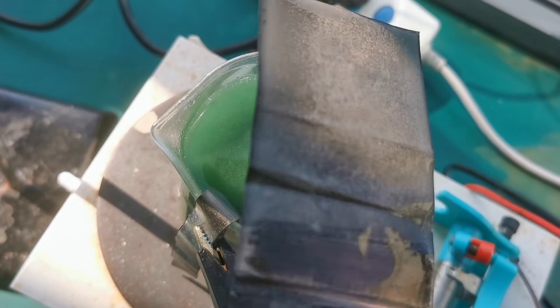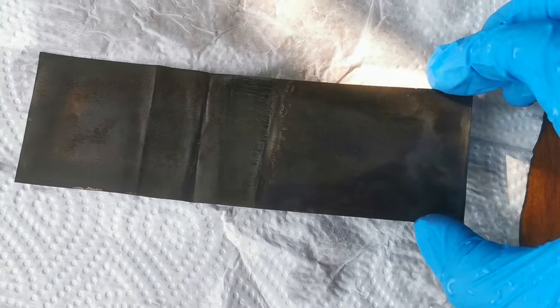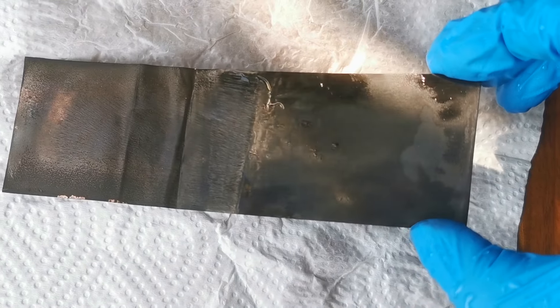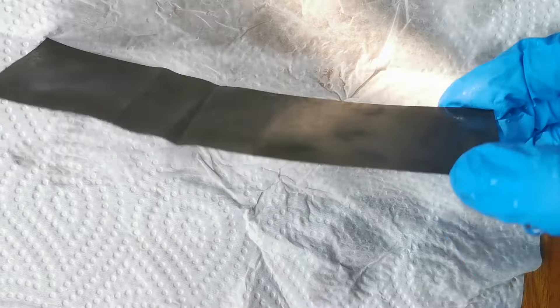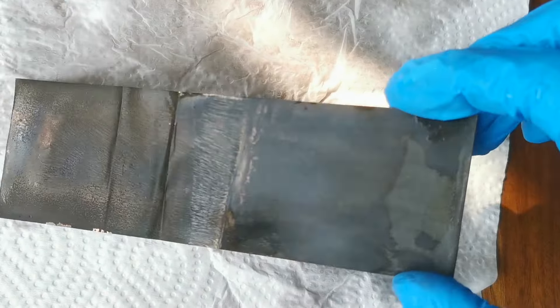Anyways, now I finally got the entire copper sheet plated in nickel. The coating on the lower section was rough compared to the upper section. When the electrode is fully dried, you can see that there is a little section of exposed copper, which was really bad.